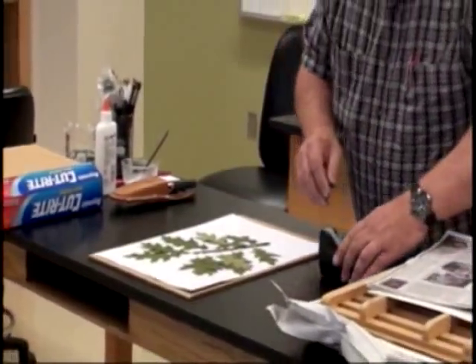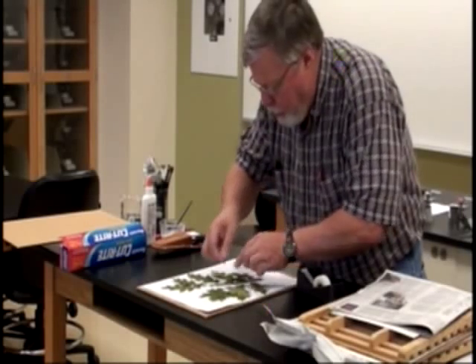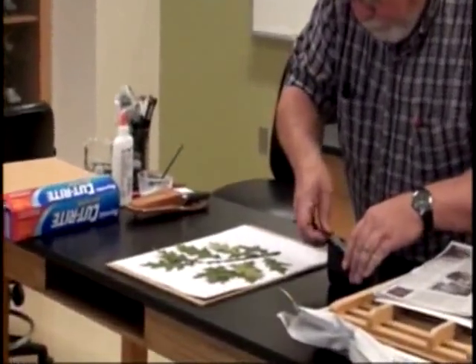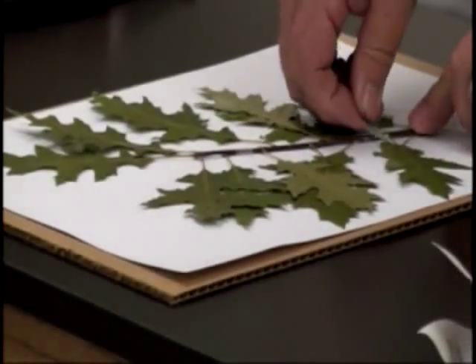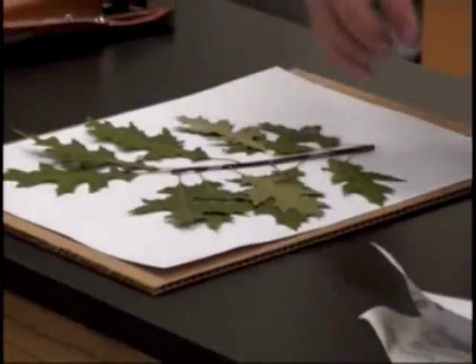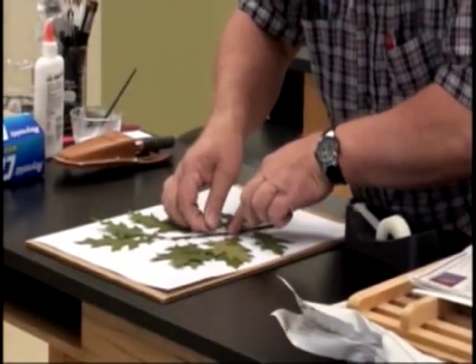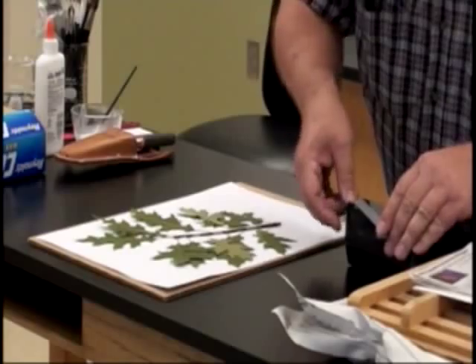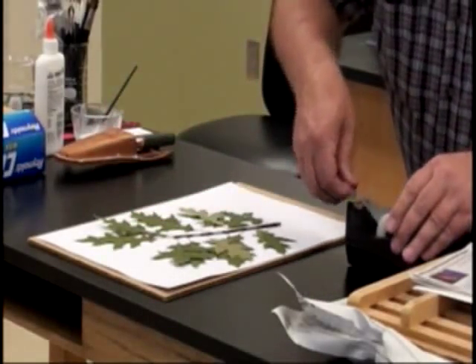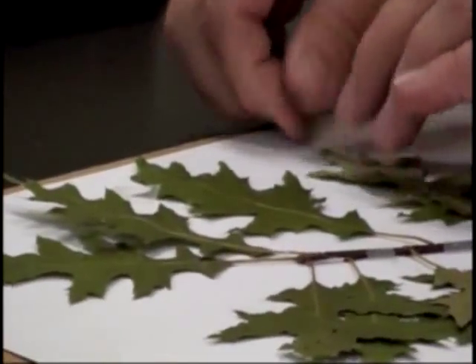You might take a little bit of tape — not an excessive amount, just a little bit of scotch tape — and tape down the stems to give them a little more support. Just little pieces. There are specialized tapes you can use, but it's really not necessary; scotch tape will do very well. You might also tape a little bit out here on the outside edge of the leaves to help adhere the leaves to the paper along with the glue.